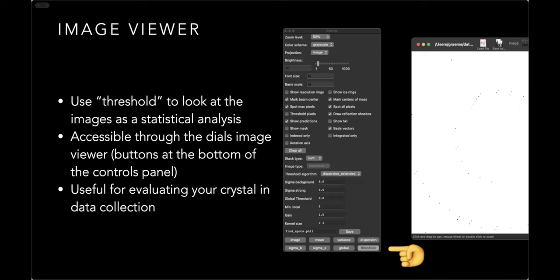Thank you. Another question came in when you were talking about the new xia2 multiplexing. You kind of hinted at this, but does this work for electron diffraction as well as it does for X-ray diffraction? Yes, it works exactly the same way. Because for the stages that Dials is doing, all we really care about is the intensities of the spots, not what they're derived from. So there's a few nuances with that.